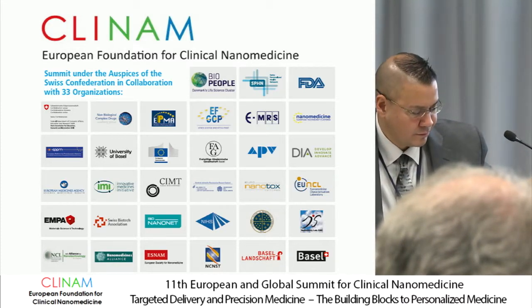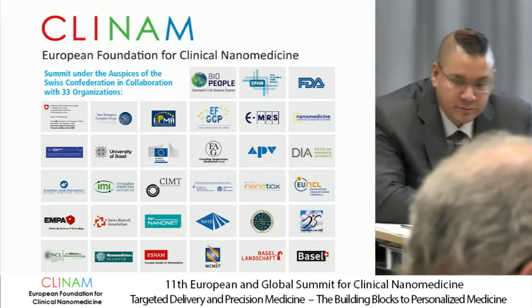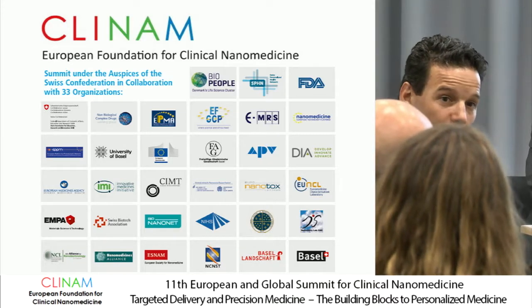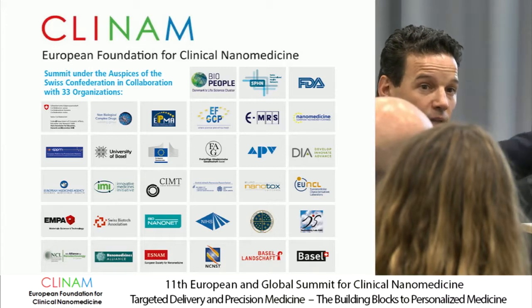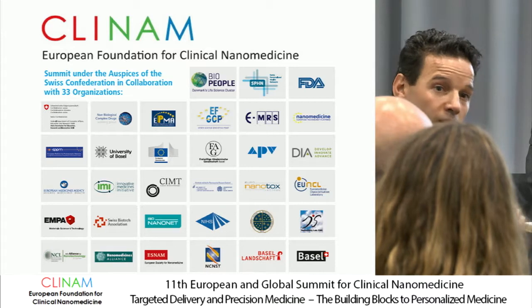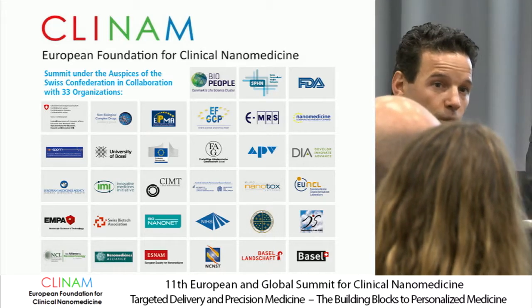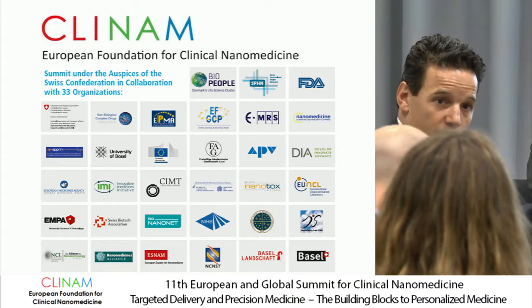Let me also give you some background, and Jeff can correct me if I'm wrong. More than a year ago, the Nanomedicine Alliance and several of us in Europe started a discussion around sizing. This involved, as Jeff briefly outlined on the ACS, engagement with industry to define the critical quality attributes for sizing and concentration, because this has become the entry point for measuring quality, for quality assurance as well in their continuous batch production.